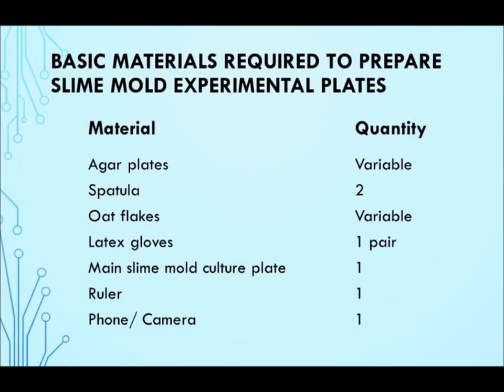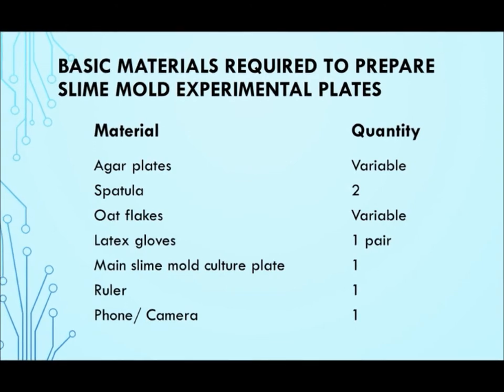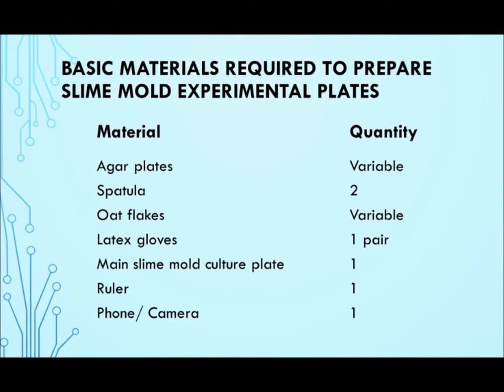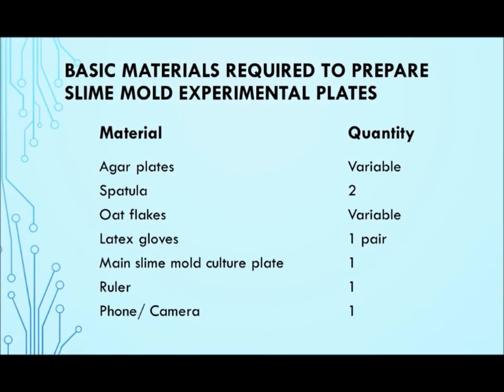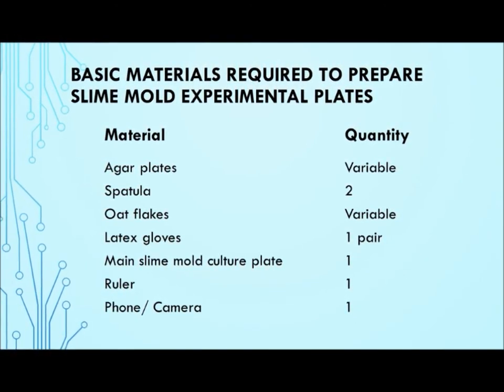This video will show you how to prepare the experimental plates for your slime mold experiments. Do note that this is a general guide and the actual procedure may vary according to your experimental design.